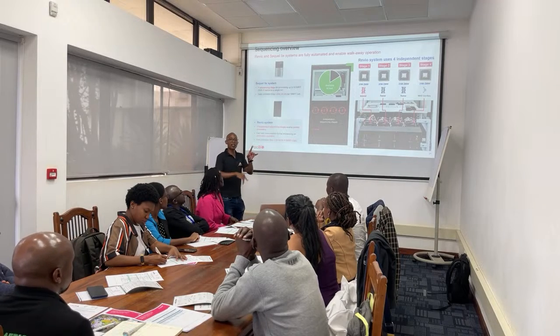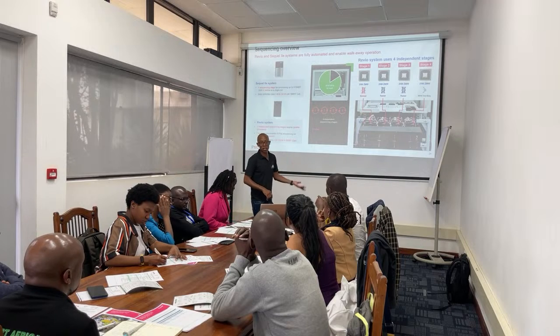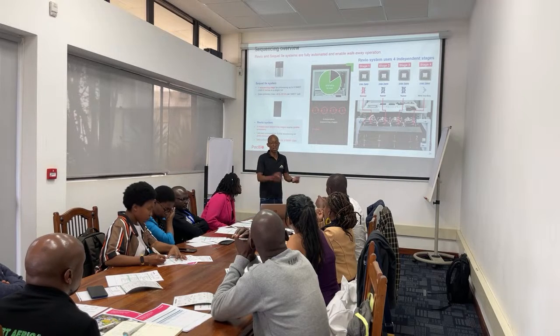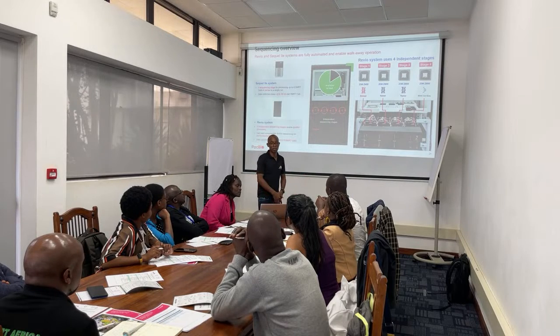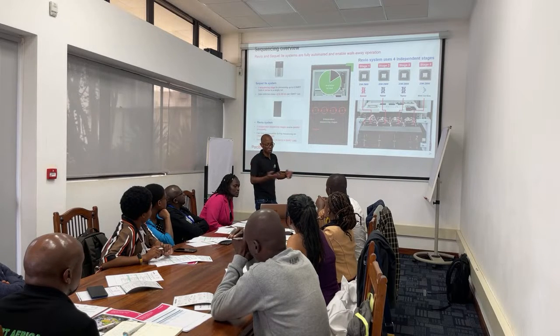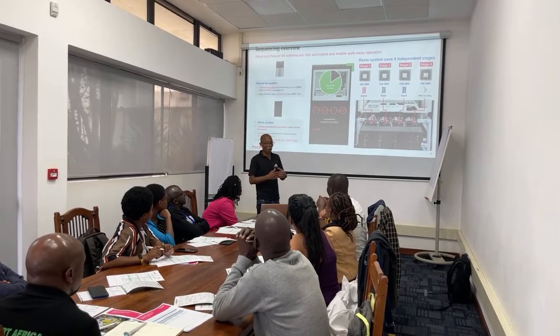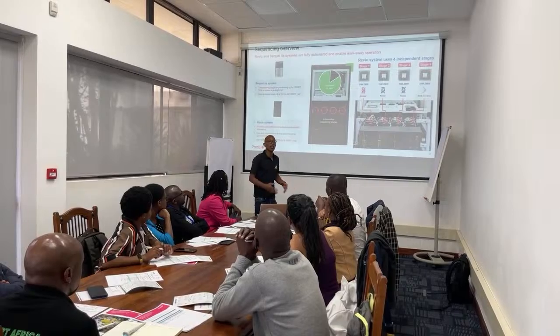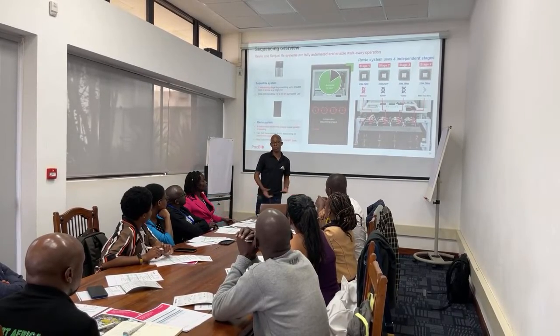So you have different run times based on the applications that you run. If you have amplicons, it runs for 15 hours. If you have bacteria amplicons, it runs for 10 hours. If you have bacteria, it runs for 15 hours. But if you have shotgun with genome, because it's whole genome based, it runs for 30 hours. If you have longer than 3 KB amplicons, it runs for 30 hours. If you have big genomes like this, it runs for 30 hours.